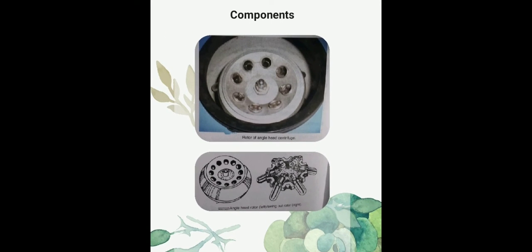The additional parts. Number 6. A timer or stopwatch. Number 7. A tachometer to read the RPM of the machine. The usual expression of RPM, revolutions per minute, gives only the centrifugation speed and does not express the centrifugal force. And number 8. The graphite brushes.